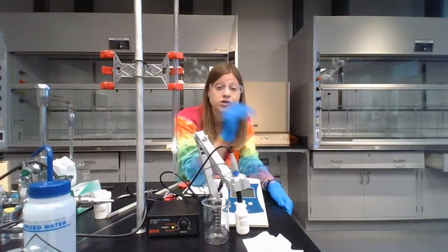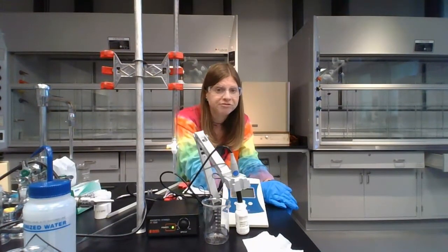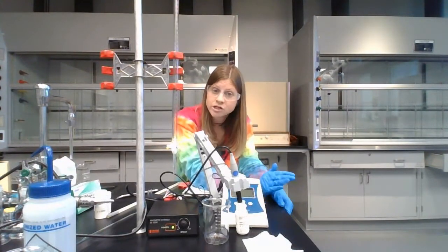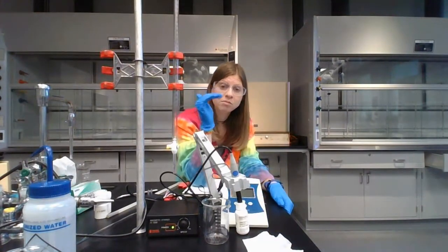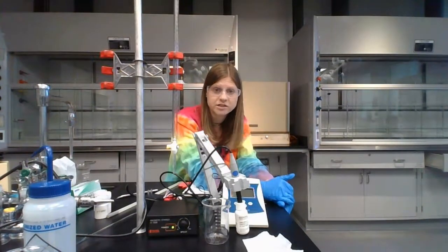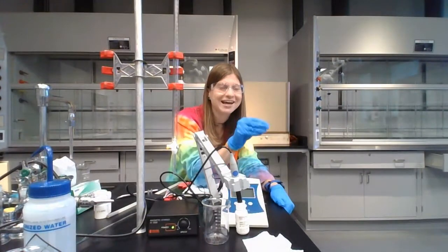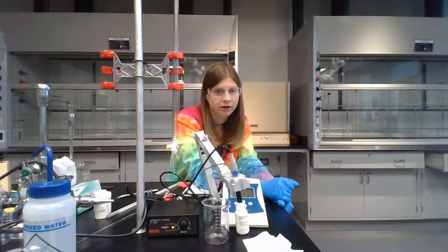So what you're going to do is add 1 milliliter increments until you get 1 milliliter before your big jump. My big jump was between 21 and 22, so 1 milliliter before that would be at 20. So I would add 1 milliliter increments until I get to 20 milliliters. Once I get to 20 milliliters, instead of adding 1 milliliter increments, I'm trying to zoom in. I want to know exactly where this big jump happened. So I'm going to start doing 0.1 milliliter increments.